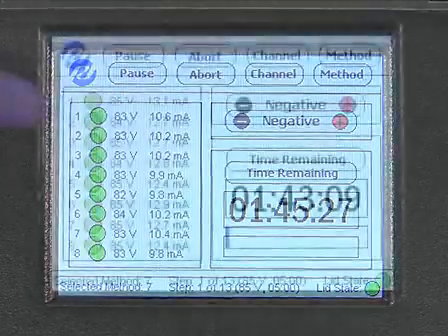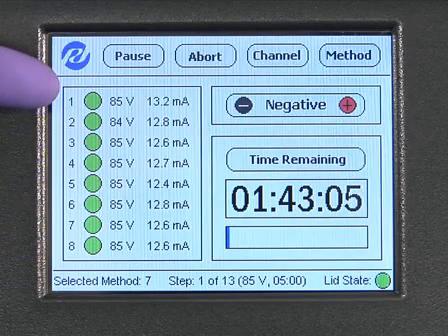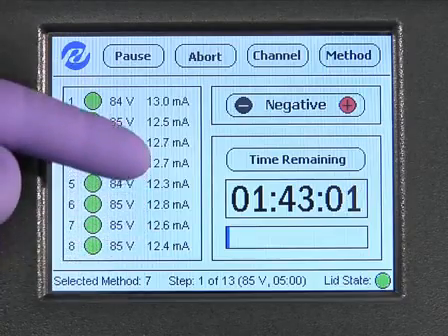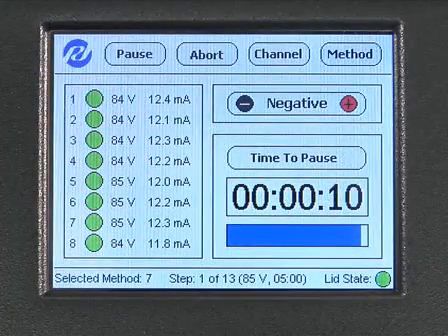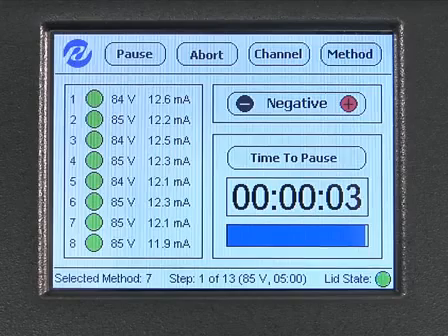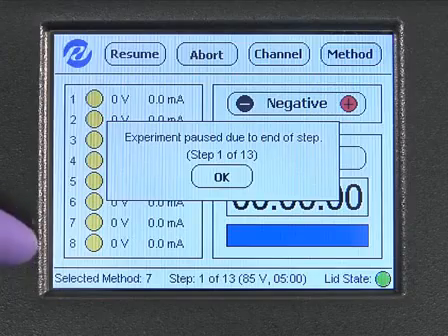While the system is running, the circles shown in the box on the left side of the screen depict the status of each channel. A green circle indicates that the channel is active. The applied voltages and currents are displayed to the right of the channel status circles. The GelFree 8100 will automatically pause for fraction collection at the intervals specified in the method. When the instrument is paused to collect fractions, a text box will appear notifying you that a pause has occurred and the status circles will turn yellow.